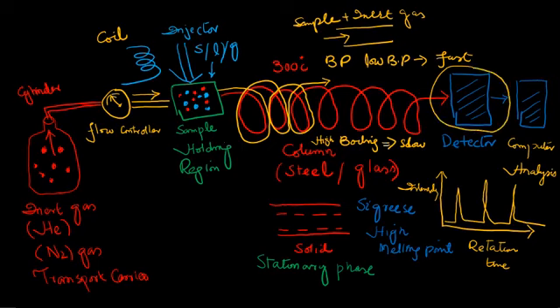So in the graph we achieve in a gas chromatogram, the first peak of the graph will represent the molecule with a low boiling point.